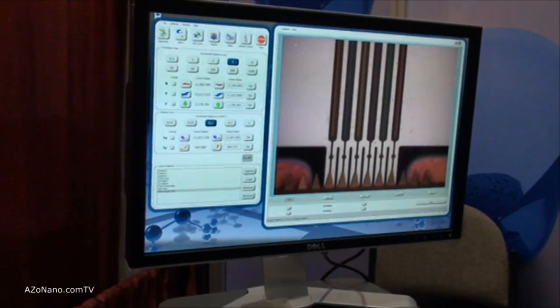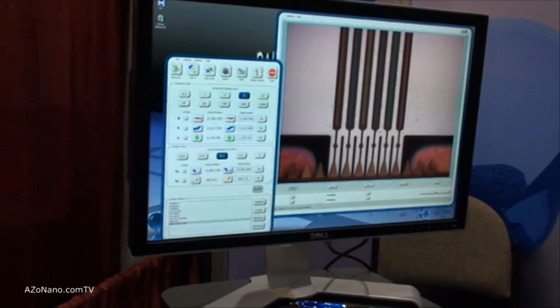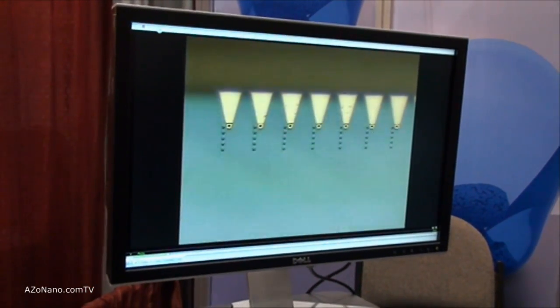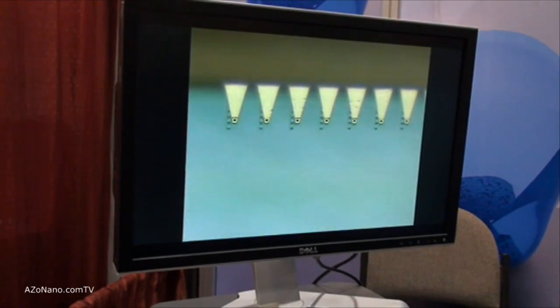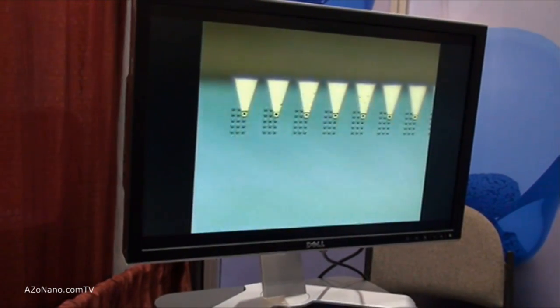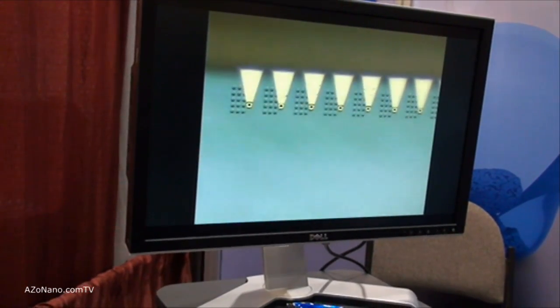And now John will change the view, and we'll actually see the device printing these tips that have been previously inked. They're actually making small deposits here. These are probably about three micron size features that we're printing. Each one of those tips, again, printing a different material in an array of dots.